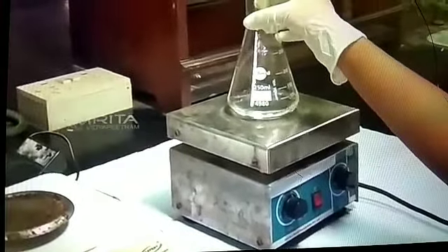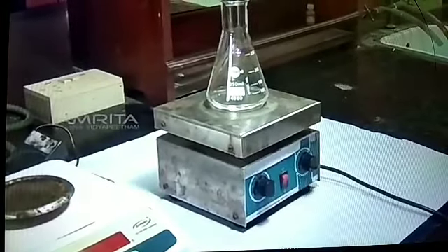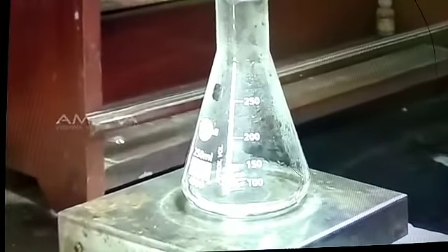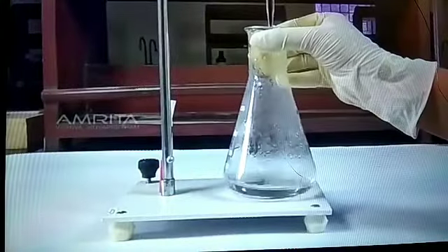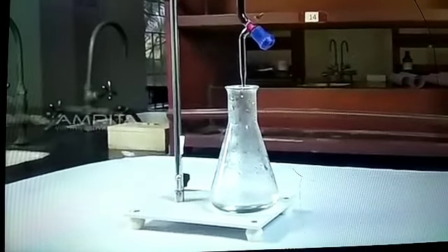Place the flask over the hot plate and heat the contents of the conical flask to 60 to 70 degrees Celsius, as the reaction takes place at a higher temperature. Place the conical flask on the white surface of the stand under the burette to correctly view the color change.